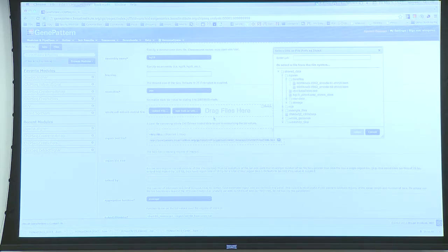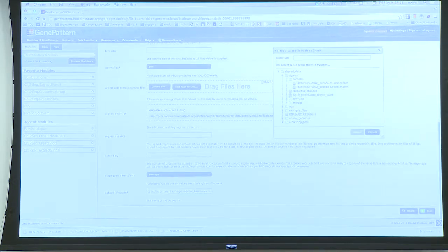But if you're taking 25 or 100 kb, then you don't have any resolution. And region bin size is when we visualize, what's the size of bins that we want to use. 100 base pairs is a nice one, but again, it's just a matter of resolution versus how big the file is going to be.